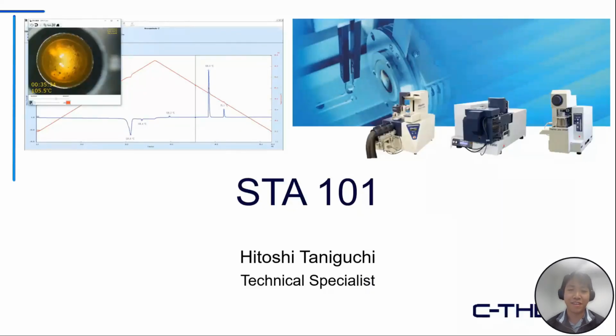All right, so hello everybody. My name is Hitoshi Taniguchi, and I'll be your presenter for today. In today's webinar, I'll be going over everything from introductory topics such as how STA works and what it does, to more advanced topics like experimental techniques that you can use to further improve your experimental data. So without further ado, let's get started.